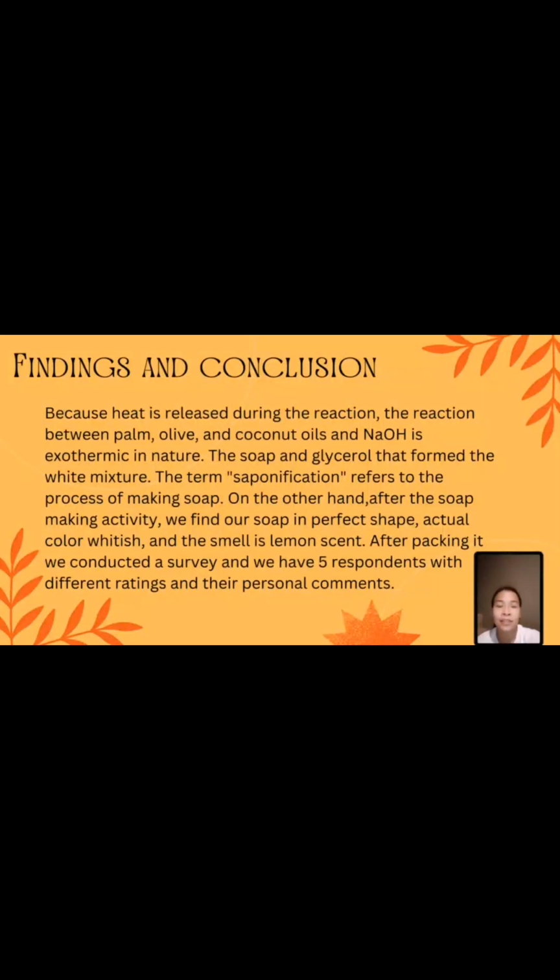Because heat is released during the reaction between palm, olive, and coconut oils and NaOH, it is exothermic in nature. The soap and glycerol form the white mixture; the term saponification refers to the process of making soap. After the soap making activity, we found our soap in perfect shape. The actual color is white, or whitish, and the smell is lemon scent because of the lemon scent that we added in our soap formulation.